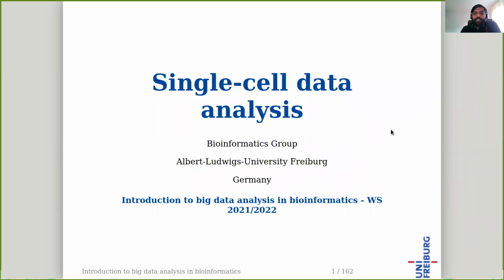Welcome to today's lecture on single-cell data analysis. In this lecture, you will learn about what single-cell RNA sequencing is and how it's different from bulk RNA sequencing, and some basic principles of the data analysis, such as quality control, data normalization, and clustering of the cells based on the gene expression profiles.